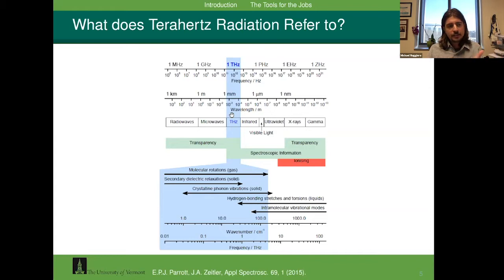Now the technology has advanced, laser technology has advanced to us being able to buy a commercial instrument for $50,000, $60,000. So much cheaper than $400,000. Still expensive, but it is now in the range of what analytical instruments cost. So it's really booming in popularity, and there's so much you can do, and I'll talk about that on the next slide, because of the properties of this type of light.